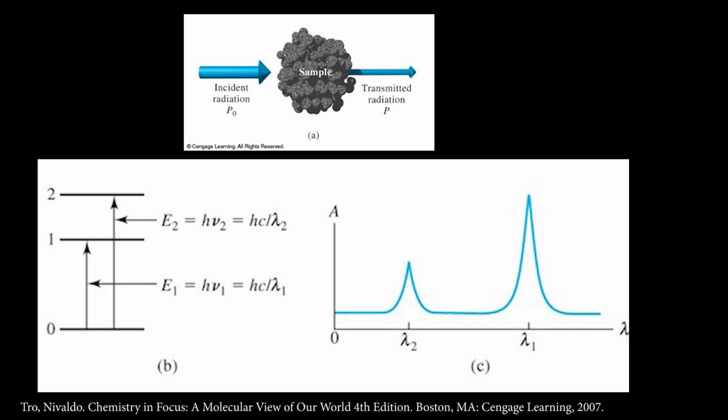I want to draw your attention to something I've taken a little bit for granted so far, and that is the A part of the figure up top. We've mostly been talking about absorbance. I talked about emission at the very beginning. That was atomic emission, where the hydrogen gets excited and then emits light. Most of the time, we don't use atomic emission in forensics. You can use emission to get atomic information about samples, but it's not nearly as good as ICP. If a lab really wants to do that, they're going to have an ICP mass spectrometer, or they're going to use X-ray methods that are also really good. So atomic emission spectroscopy is not very common in forensics labs.